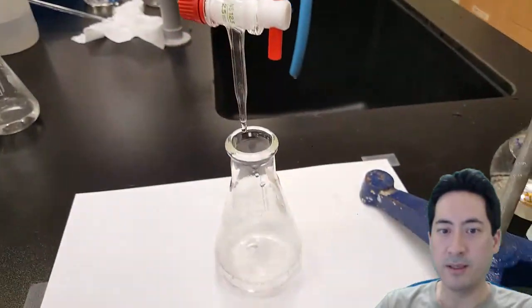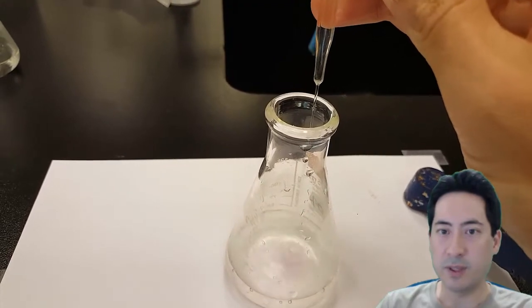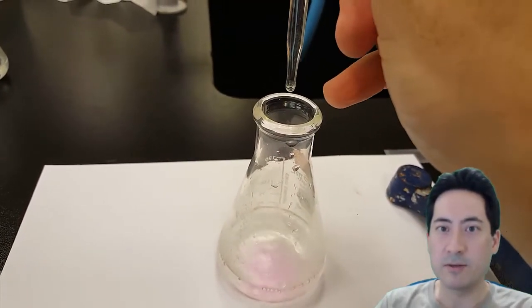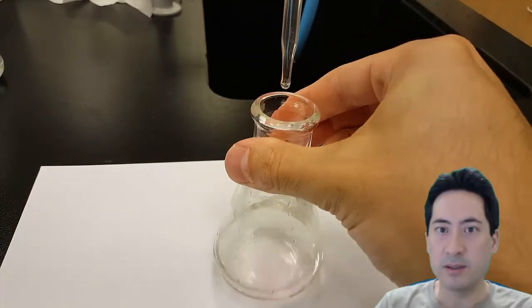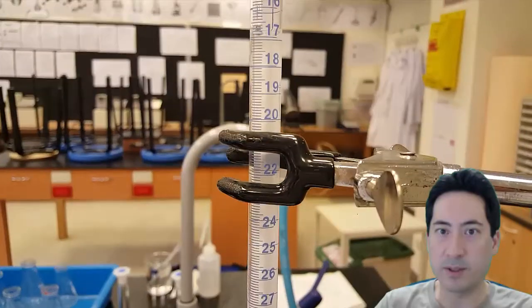And so you can see here that the liquid is falling out really quickly. And as soon as it goes pink, I'll stop it and that'll give me a rough idea of what the answer is. And there you can see it's falling down quite quickly. It's going like one mil every three seconds.